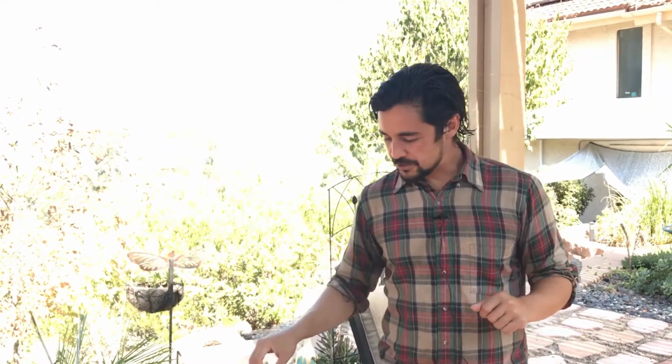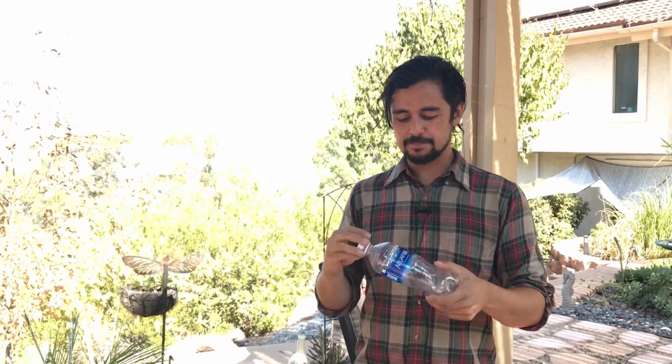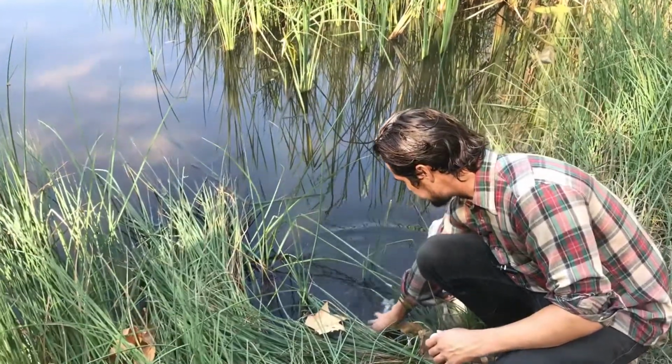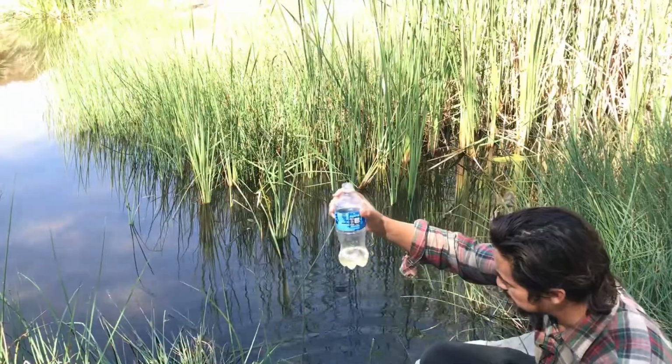So once you go to the pond, you're going to need some supplies to collect that pond water. I recommend a little water bottle, something that's used and empty that you can collect a small amount of pond water and then take that to wherever you're going to make your observations. This will allow you to work further away from the pond at your own leisure. So you'll need a water bottle.